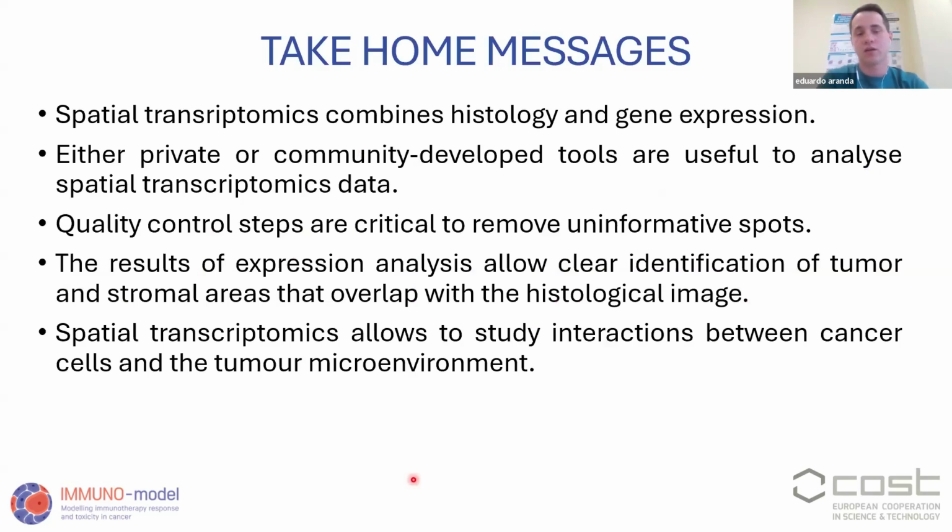And the conclusion about this presentation is that spatial transcriptomics combines histology and gene expression. Either private or community development tools are very useful to analyze spatial transcriptomic data. However, with Seurat, you can have a more flexible and personalized analysis. Also, quality control steps are very, very critical to remove the spots with very low quality.